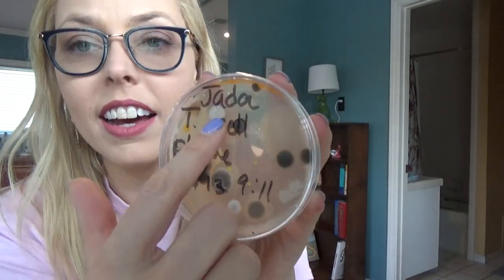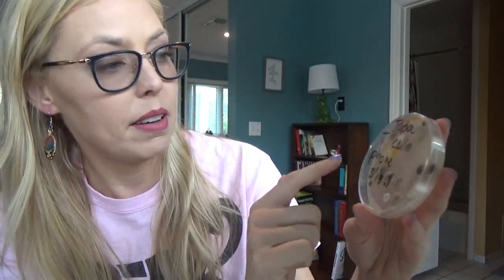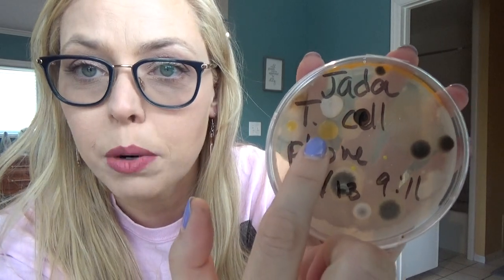Let's look at the cell phone. Not too bad — I think Ms. Jada might clean her phone. But we've got a lot of orange growing up here, a lot of black spots, some white, and yellow growing in here. There is some gross stuff happening on this phone, but probably not any more gross than any of our cell phones. I didn't swab my own phone, but I'd expect mine would be just as bad if not worse, because I hardly ever sanitize it.